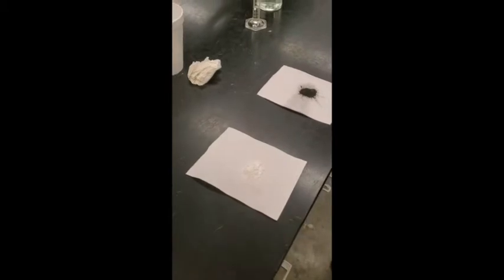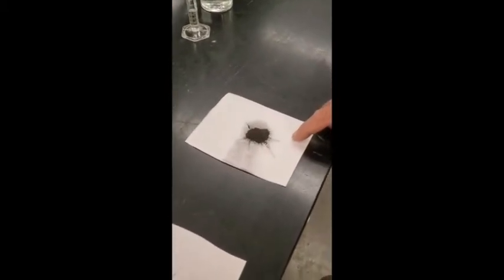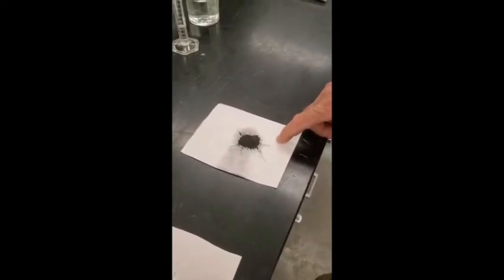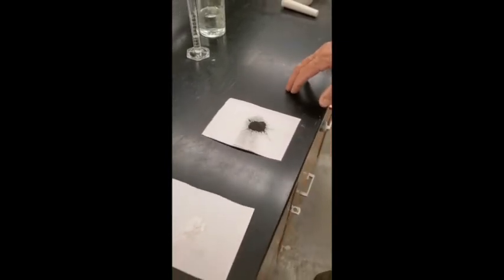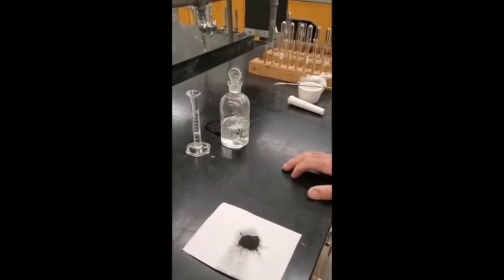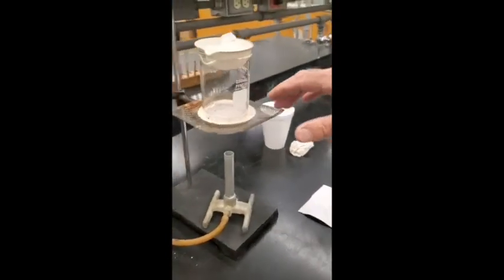You can see it's a white crystalline material, ground up to a nice powder. And then the oxidizing agent to oxidize the iodide ion to iodine is manganese dioxide, MnO2, excuse me, and it's the manganese in the +4 oxidation state. And sulfuric acid is needed for that to act as an oxidizing agent. And we're going to carry out the reaction in this 250 milliliter beaker.